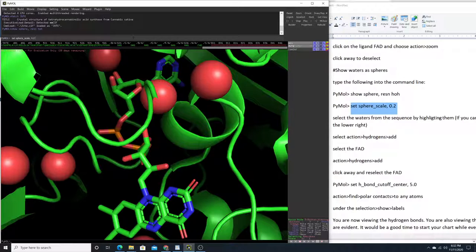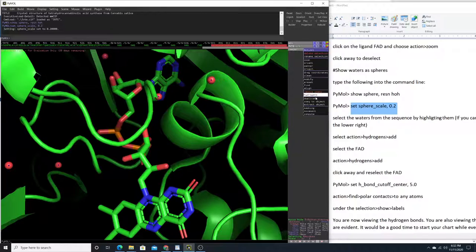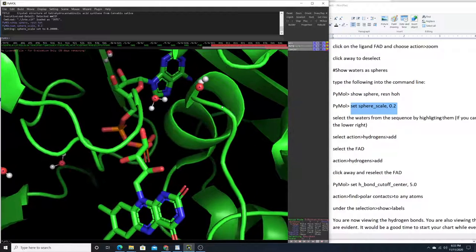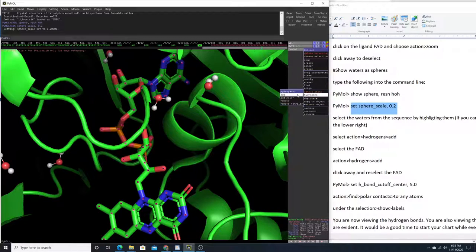Now we want to select those waters and add the hydrogens. I like to see the hydrogens on the waters — this is optional, as the hydrogen bonds will still show even if you don't add them. Select the waters, then go to Action > Hydrogens > Add. Now you can see that we have complete water molecules. Next, select the FAD and also go to Actions > Hydrogens > Add.